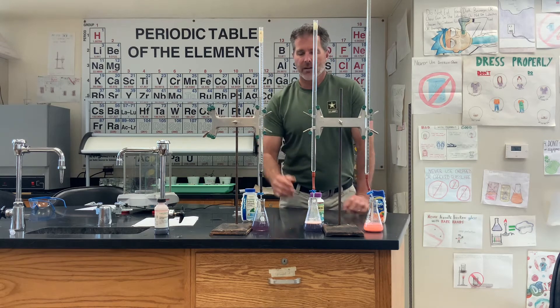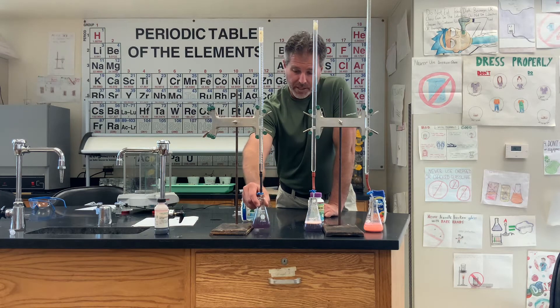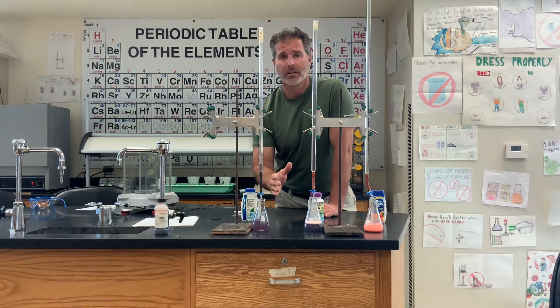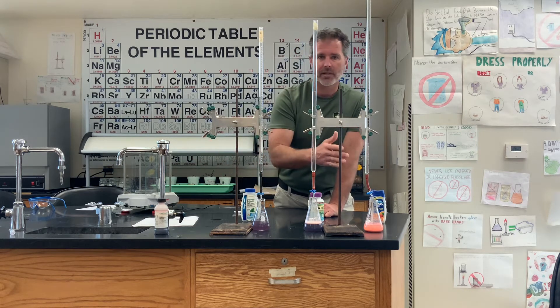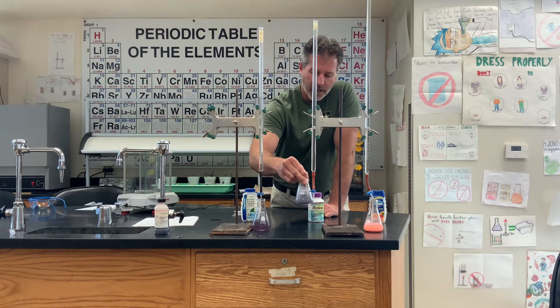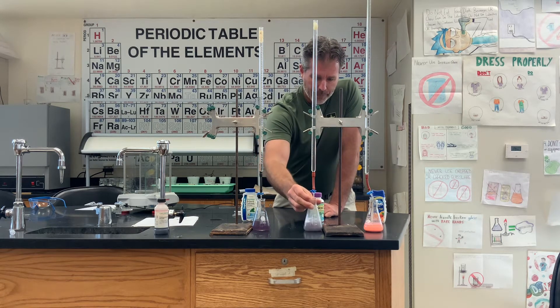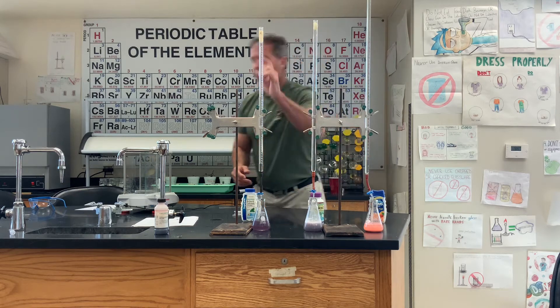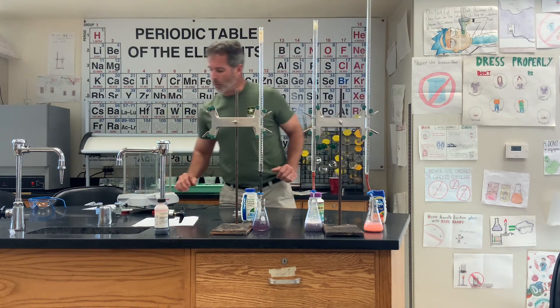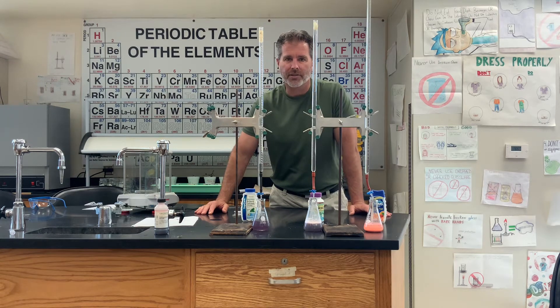The Top Care one I already took care of — I neutralized it. It turned to this purple color, and that's what I'm going for. That means I'm at the end point. One more drop and I'd go blue; one less drop and it was red. For the Top Care, I used exactly 21.55 milliliters of hydrochloric acid.